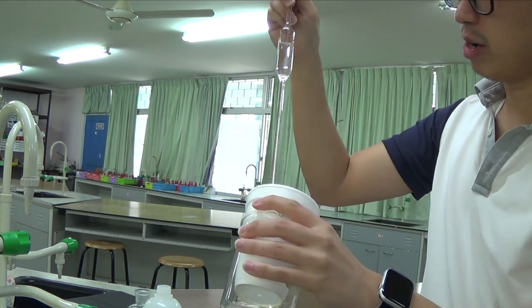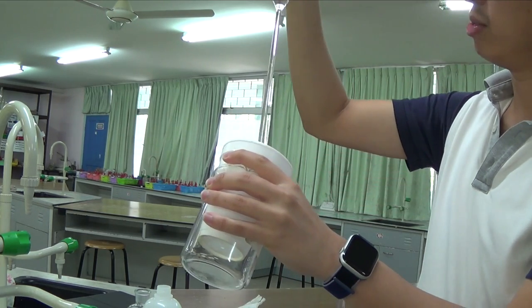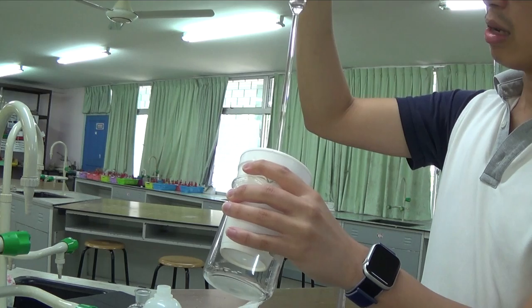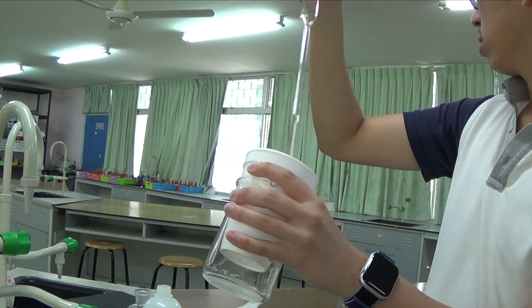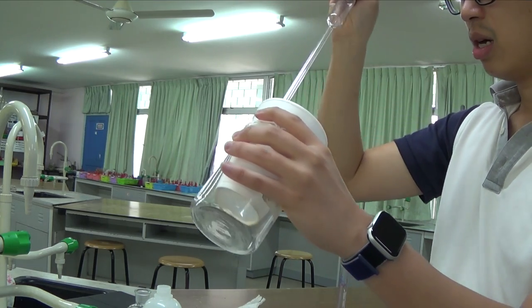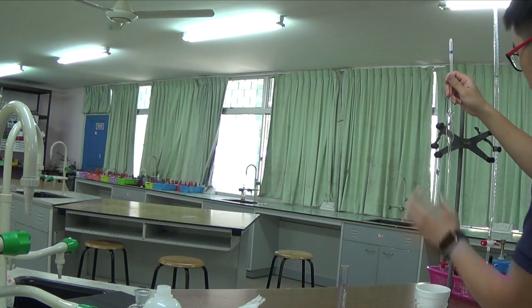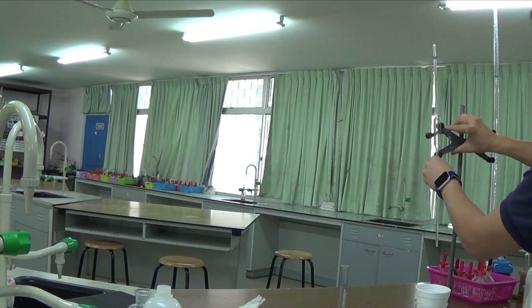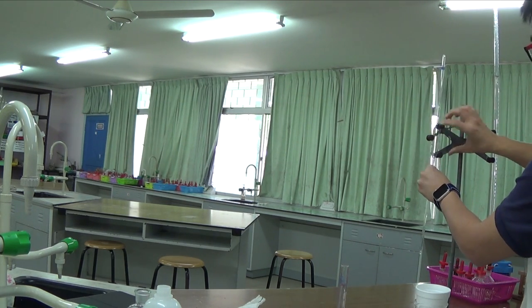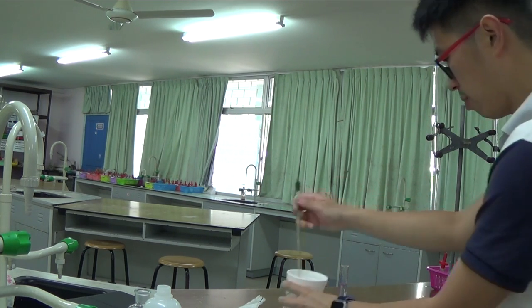I'm running out of energy now, so I'll stop talking for a little bit and just concentrate on getting the rest of the results. So it does take some time between cleaning up your stuff and doing the next bit. So until you're very clear of the procedure, you're always going to be disadvantaged when you do this kind of practical thing. Okay. Let's see. I'll put my thermometer there.